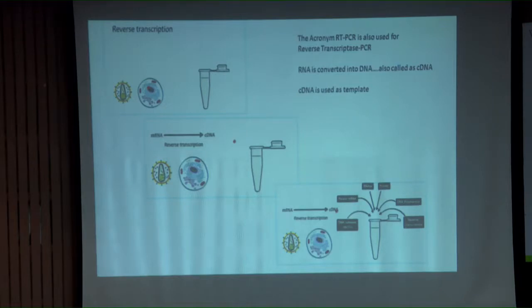Yeah, this is a pictorial depiction of what's really happening. I'm just tempted to tell you two variants of this particular technology. Remember, qPCR applications, I already made a mention here for gene expression studies. They are one of the most handy tools, right? Gene expression, the moment I talk about gene expression, you have to talk about RNAs only, right?